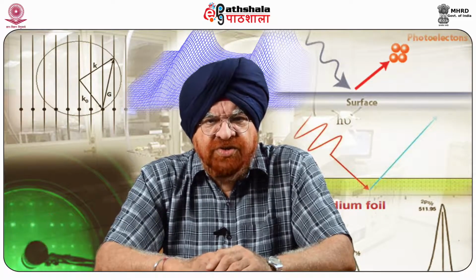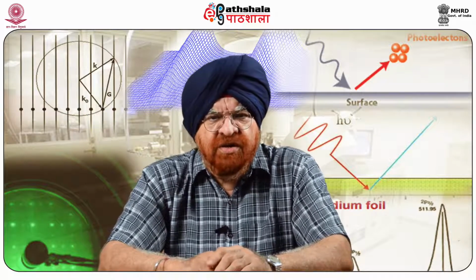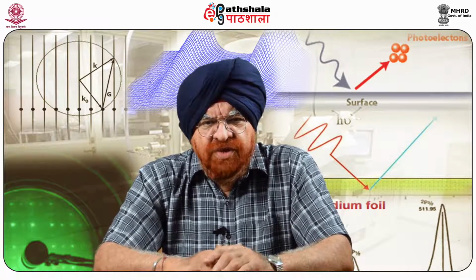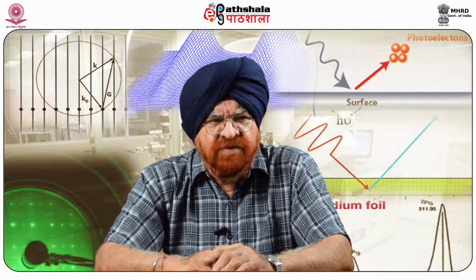Today, we are going to discuss the module Electrochemical Scanning Tunneling Microscopy, wherein we will deal only with the introduction part. This will be under the paper of Surface Analytical Techniques, Part 1.